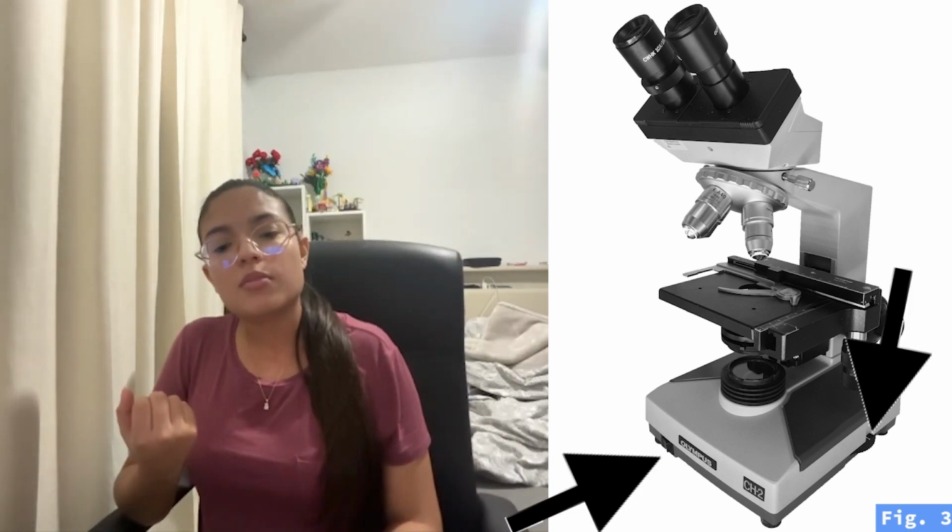And then finally, at the very bottom, you have your light switch and light adjustment that control the amount of light coming from the bottom up to the specimen and let you actually see what is happening on the stage. These are some of the more general terms because there are more technical and complicated aspects to the microscope, but for general use, these are the key parts that you need to understand about your compound microscopes.